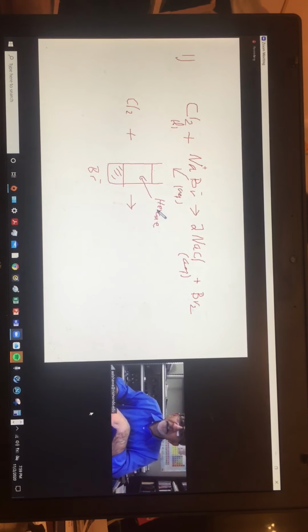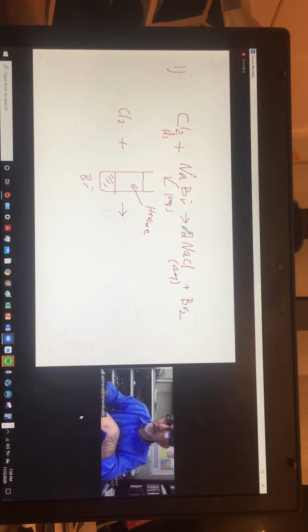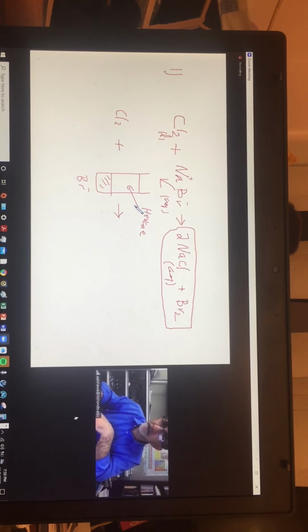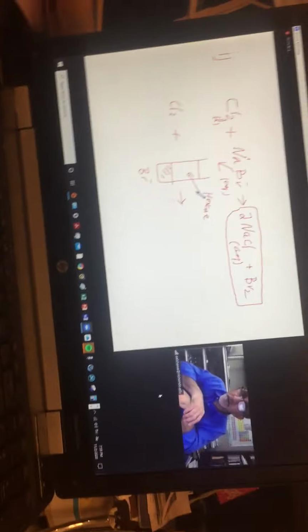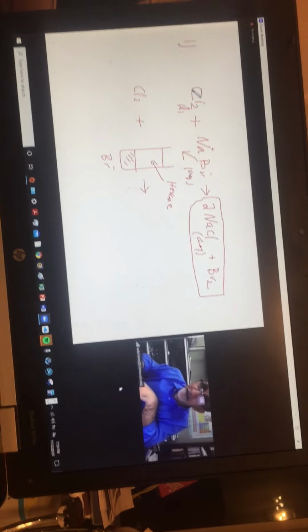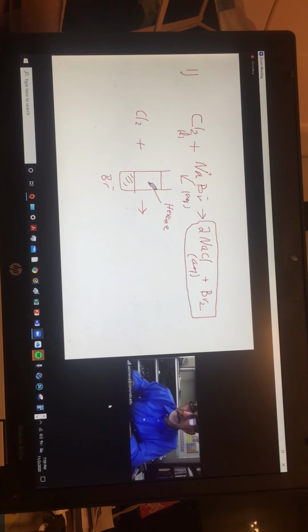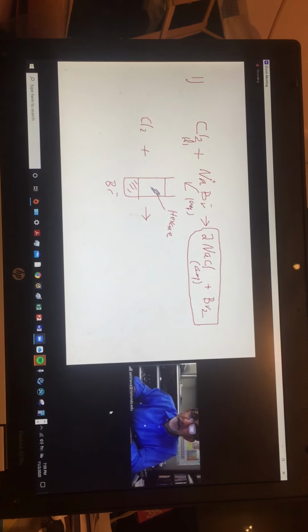means you're going to find in the hexane layer, the organic layer, that molecule, bromine. Because what is the outcome? That solution mixture, plus the hexane. The hexane is going to extract whatever molecules survive. If that chlorine molecule did not survive, it means it breaks apart as ions, and would not be migrating into the hexane. If the bromine formed, it is going to migrate into the hexane.